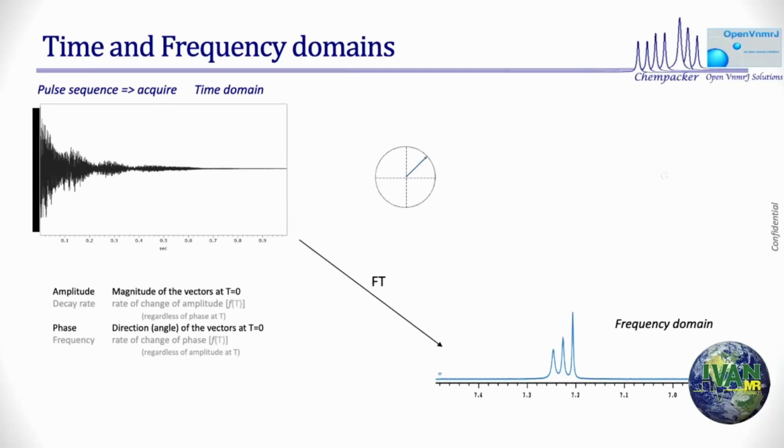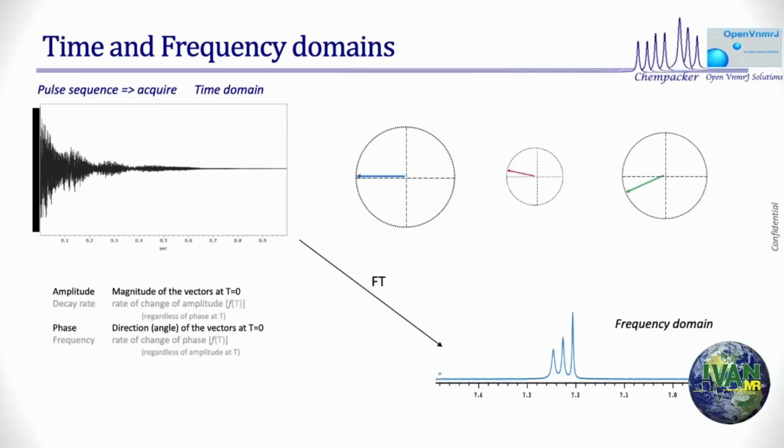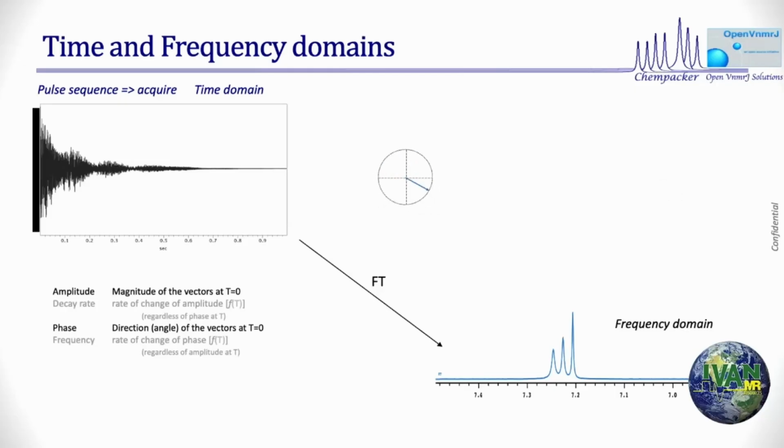Except those three signals are not the same height. I just made a statement that all those three had equal magnetization. Detectability should be the same. So if I use peak height, I lost it. All three do not have the same detectability. So what's the problem? The problem is not that the magnetization is wrong or FT is wrong. The problem is the frequency domain. We are measuring it from the frequency domain. That's the mistake. Your detectability should not be from the frequency domain.